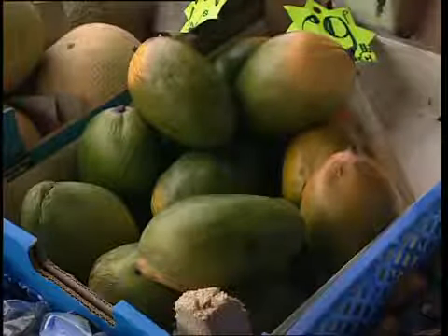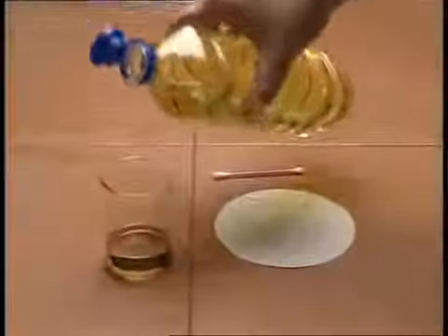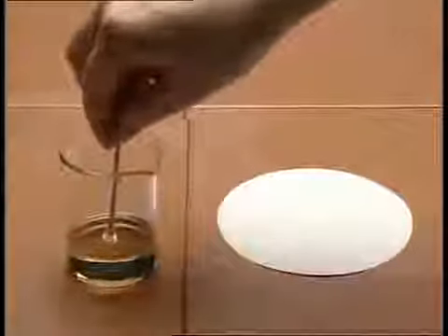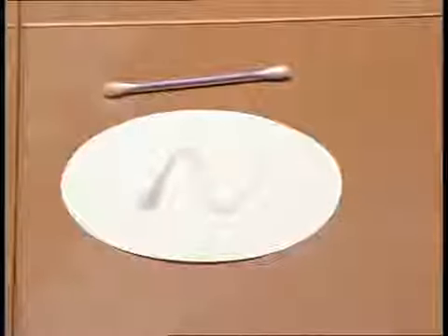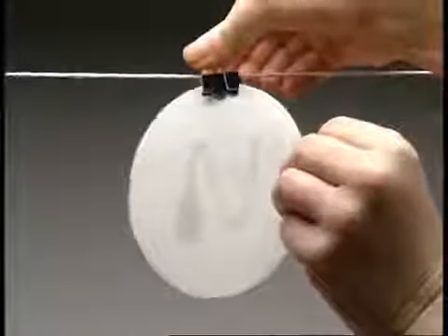To find out whether a food contains fat, carbohydrate or protein, there are some simple tests. We'll be testing bread, nuts and grape juice. The first test is for fats. Vegetable oil is 100% fat. A simple test is to rub a sample onto a piece of paper and then allow the paper to dry. Hold it in front of a light and a translucent mark indicates the presence of fat.